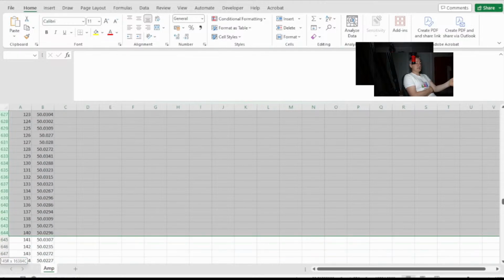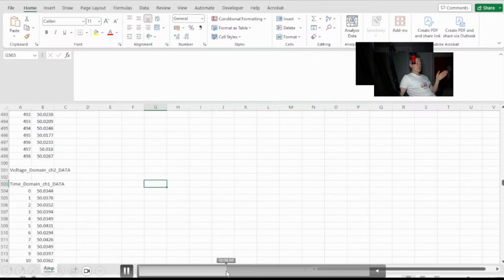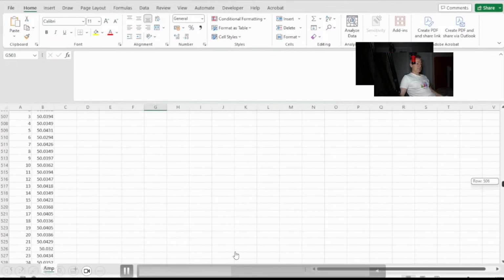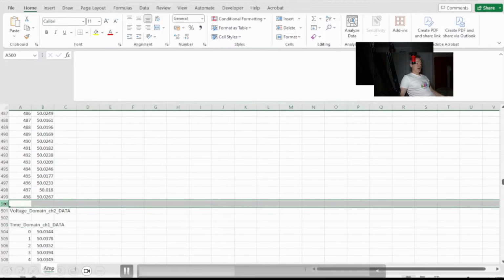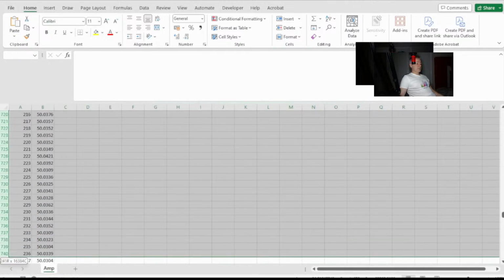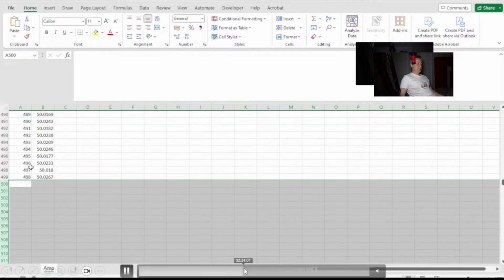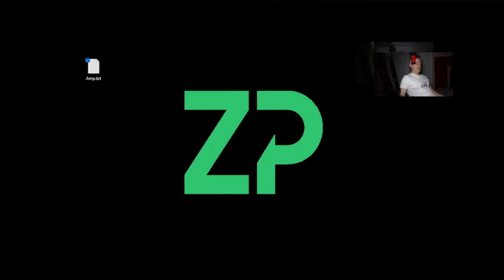The reason I'm deleting a little bit more data here is that the experiment seems to have been repeated in this file format. There's a set of data, I recognize it, but then when I scroll down I find another set of data which seems to be an absolute repeat of the first set. So I end up deleting that as well. Now I've cleaned up this file, and I'm going to save it as a text file, and then I would say it's good to go. So now I've got my Anapot text file here.